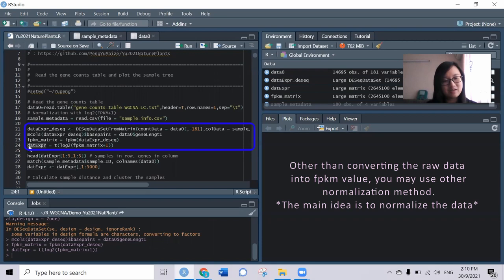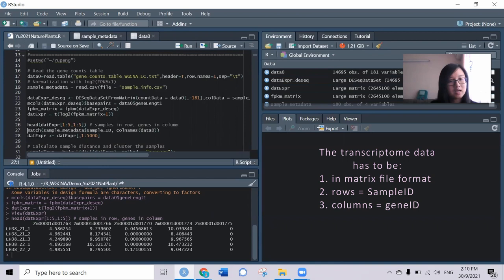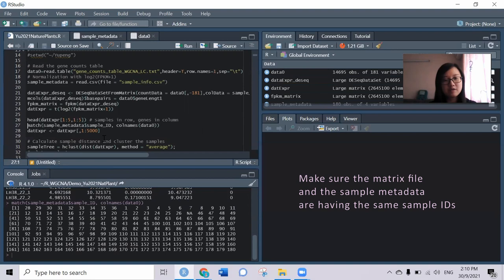This is the expression data we're going to use in the following steps. Let's take a look. We've made the samples in the rows and the genes in the columns, and try to match to see whether the sample metadata has the same sample ID as the expression data. They're quite similar.